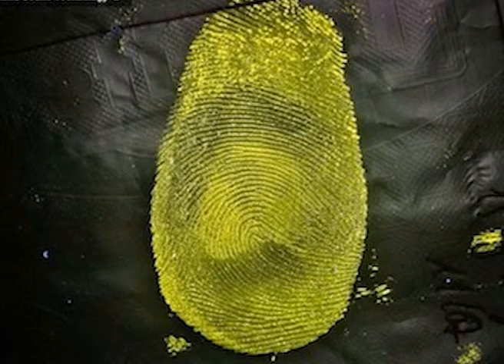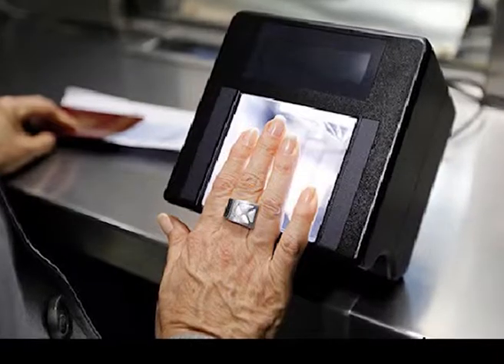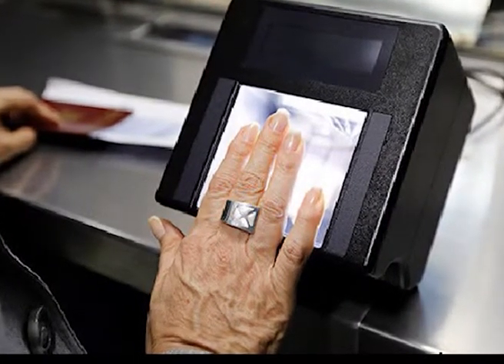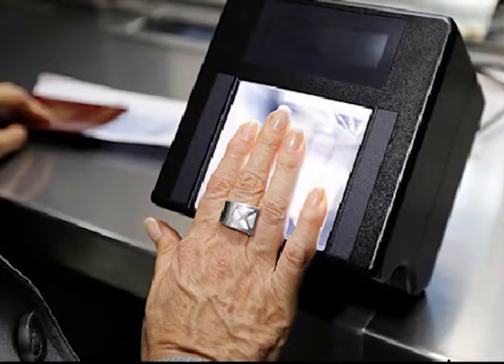Many surfaces interact with Ninhydrin, giving a strong background coloration that masks the developed prints. Further, the concentration of amino acids in perspiration is quite low and hence the developed prints usually do not show a sharp contrast. Moreover, the method is not applicable to non-absorbent and dark surfaces. Lastly, on many items, the Ninhydrin developed prints tend to fade out within a very short span of time.